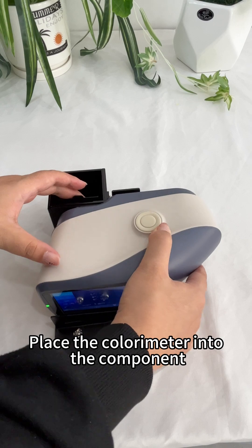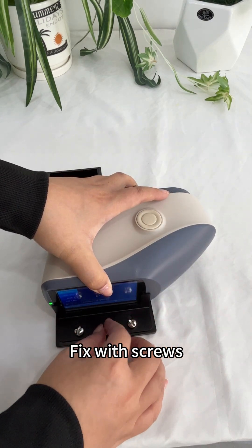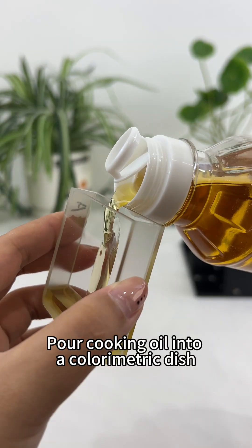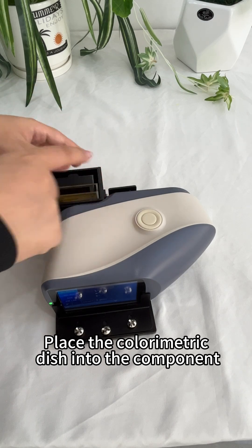Place the colorimeter into the component and fix it with screws. Pour cooking oil into a colorimetric dish, then place the colorimetric dish into the component.